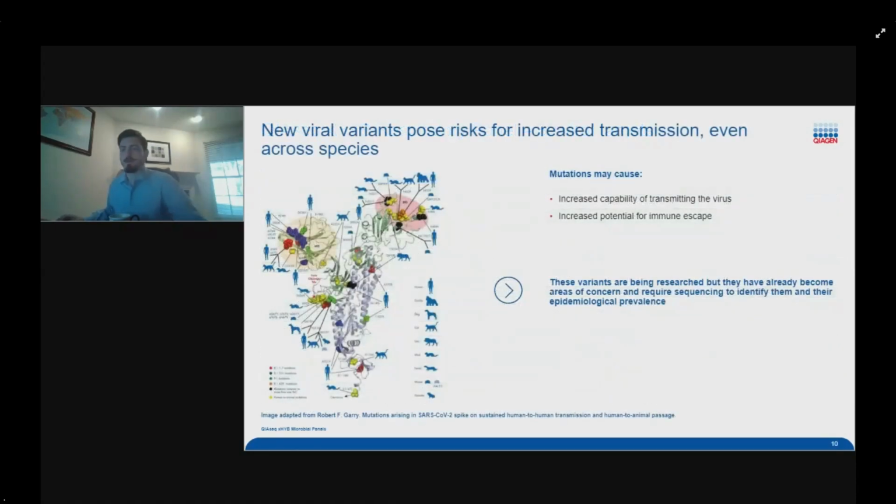Now, many of you may already be aware of the importance of variant tracking of different viruses, but in the past 2 years, the importance of doing variant tracking to keep track of viruses has become much more clear with SARS-CoV-2, where we're trying to track and make sure that there's no widespread virus that has moved towards immune escape away from the different vaccines that have been designed, and give us a little more lead time to design new vaccines if they need to be designed.